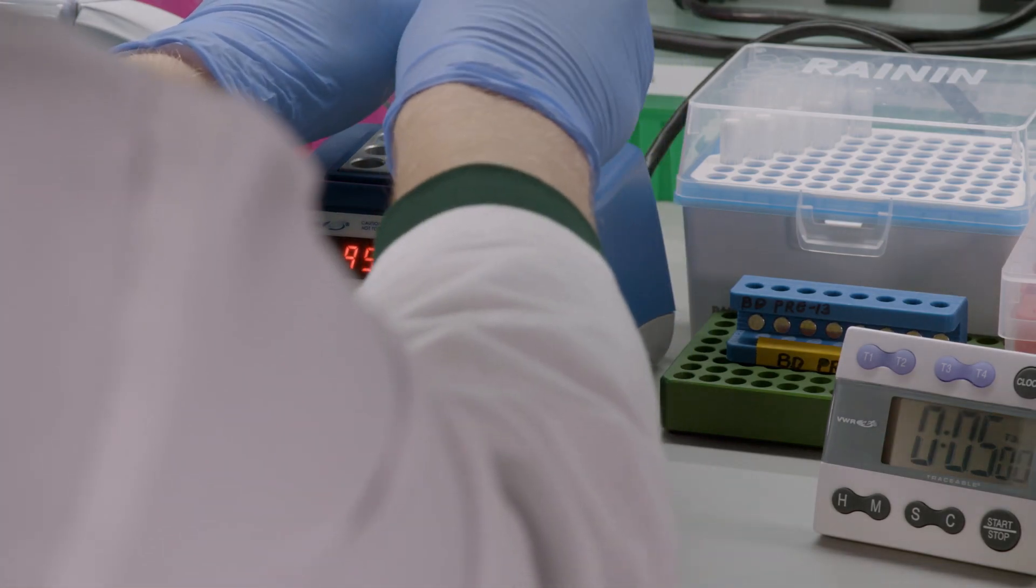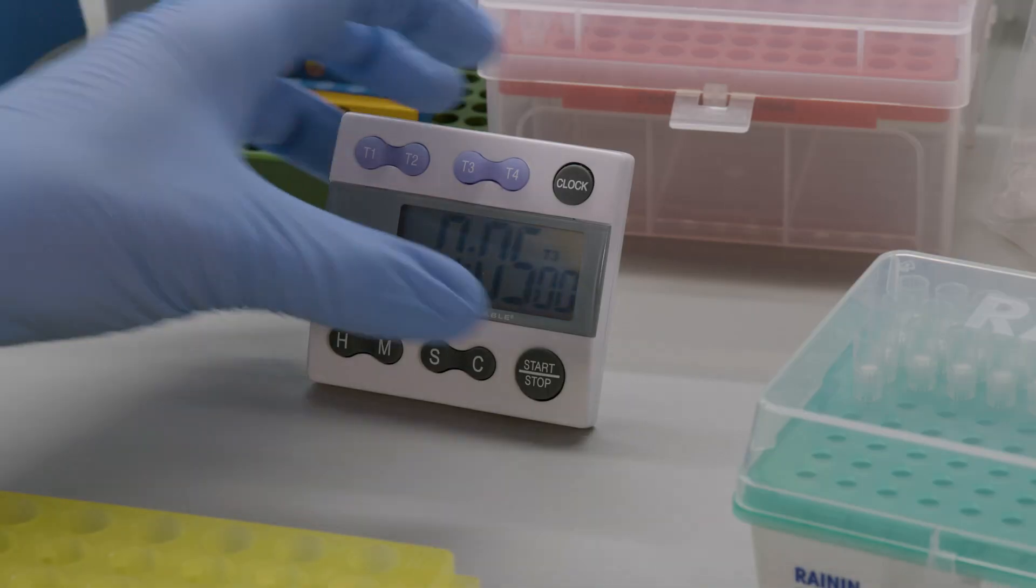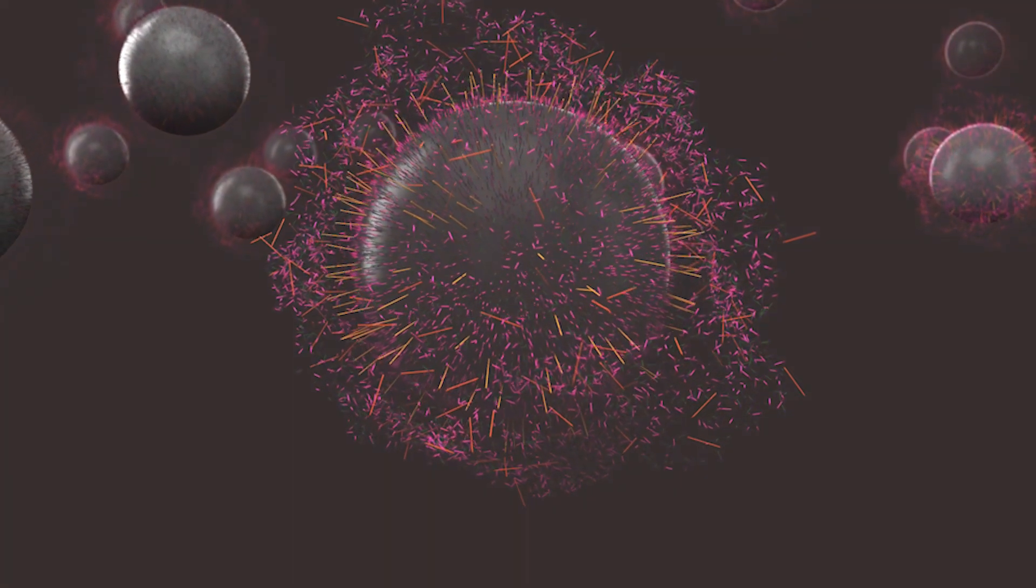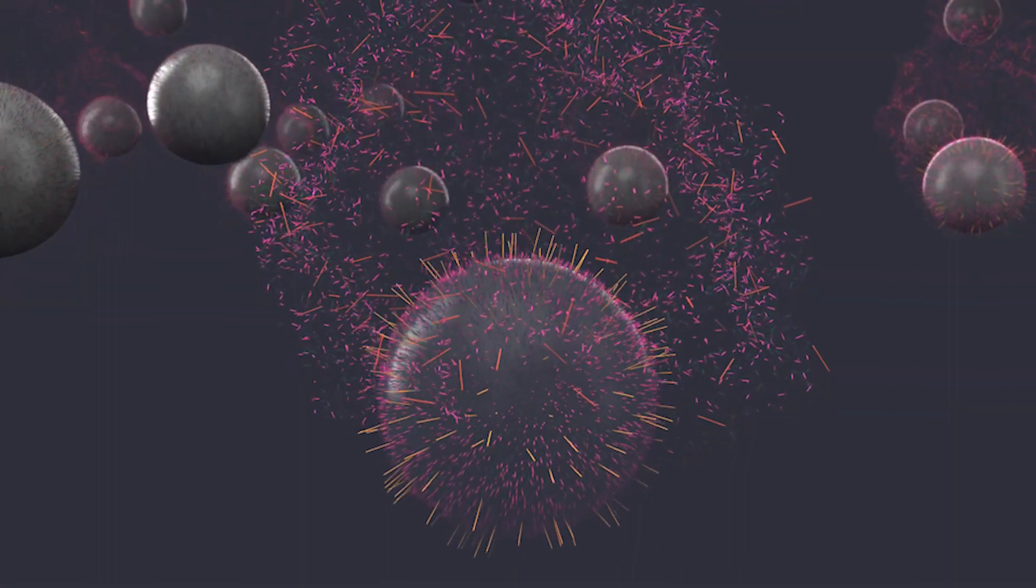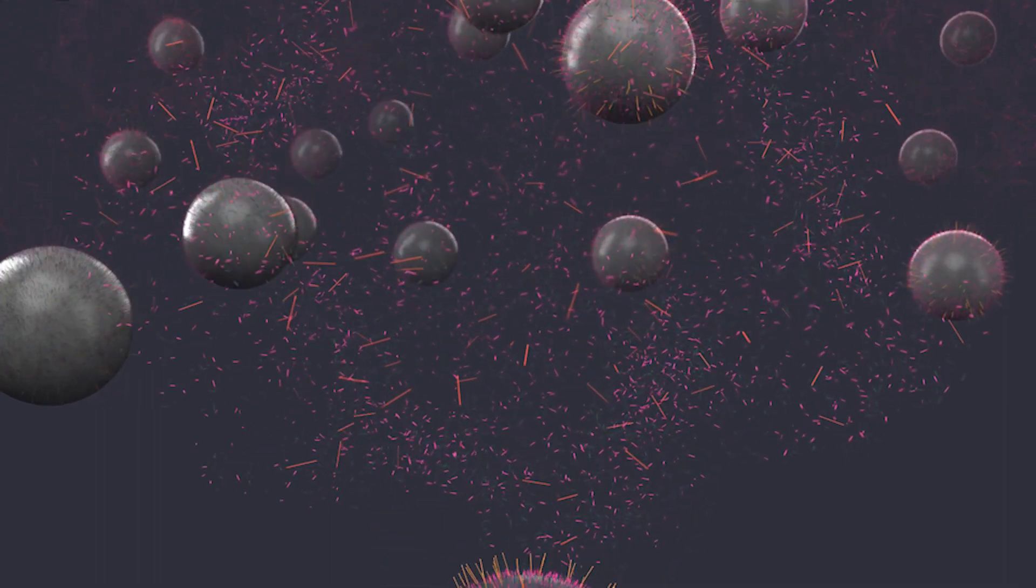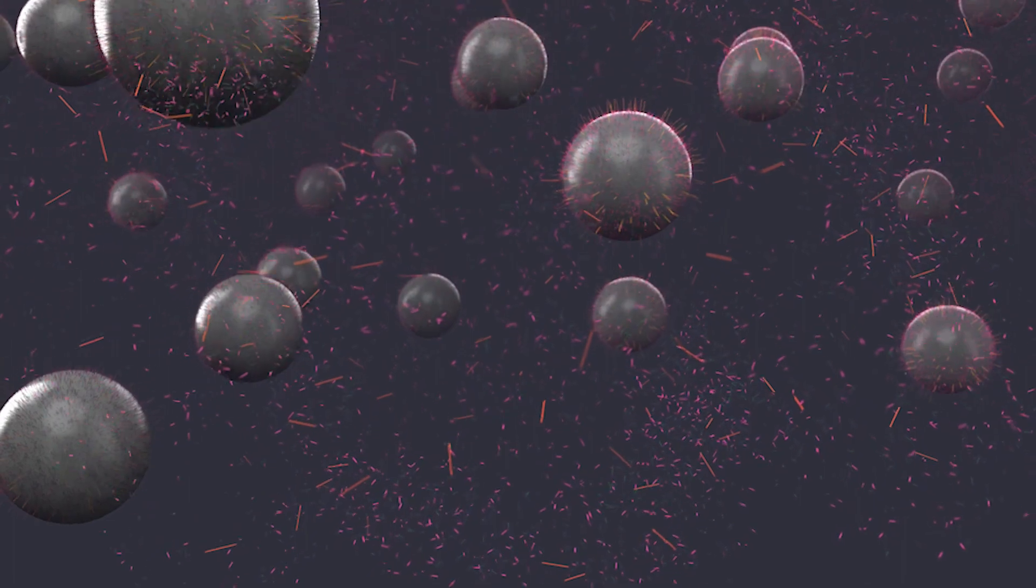Place the resuspended beads on a 95 degrees Celsius heat block and incubate for five minutes. This will denature the randomly primed and extended or RPE products from the beads while leaving the cDNA covalently bound to the beads. The beads will settle during this step and that is perfectly normal.